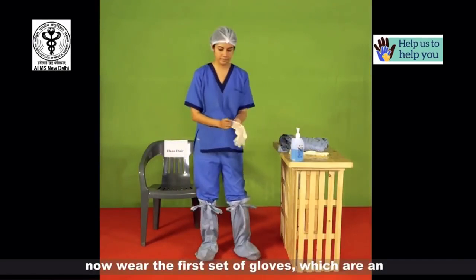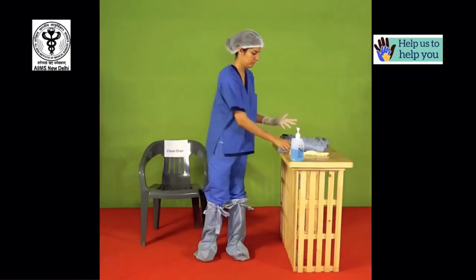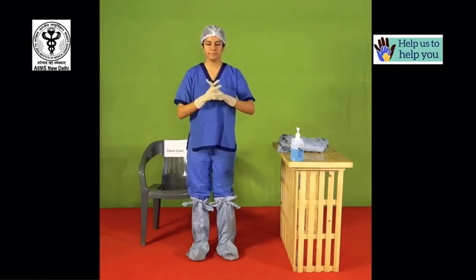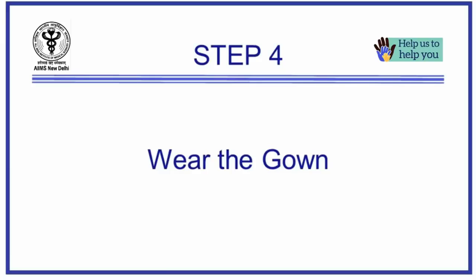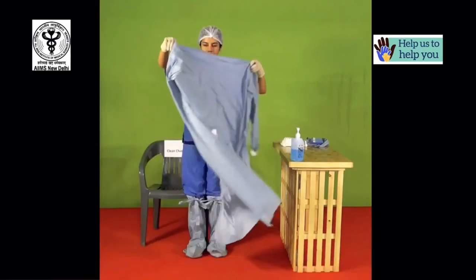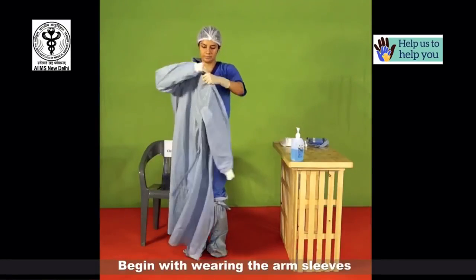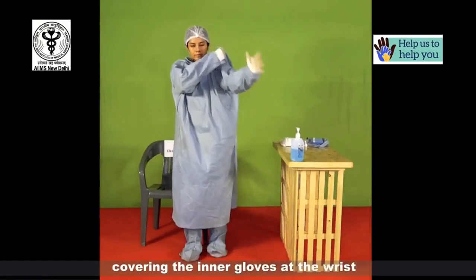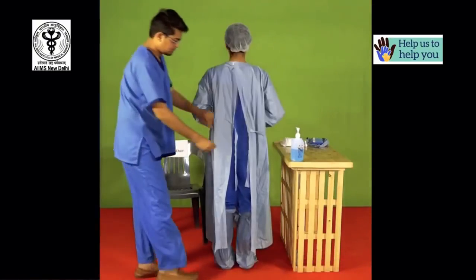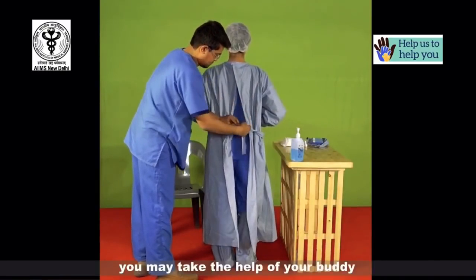Now wear the first set of gloves which are an adequate fit to your hands. Now let's examine the gown for any damage including tears. Begin with wearing the arm sleeves covering the inner gloves at the wrist. Wrap the gown leaving no area exposed; even at the back, you may take the help of your buddy.